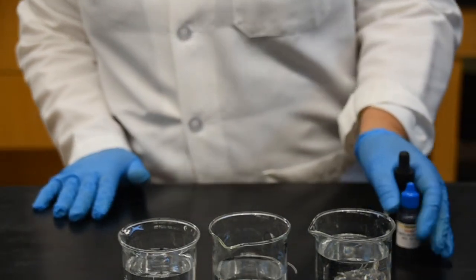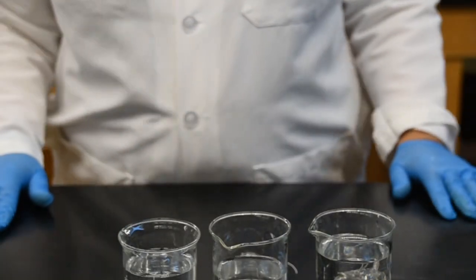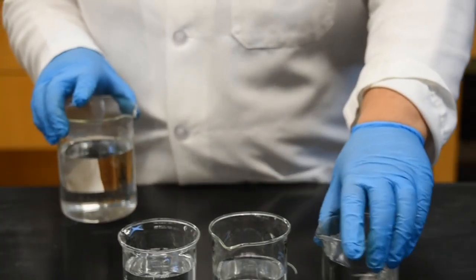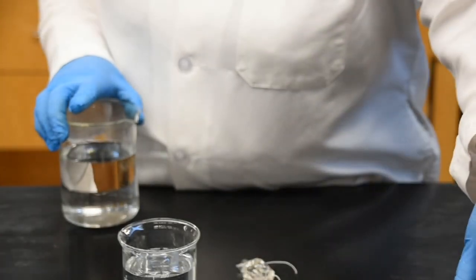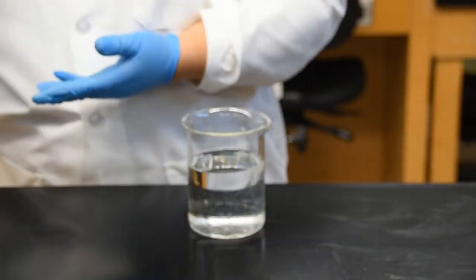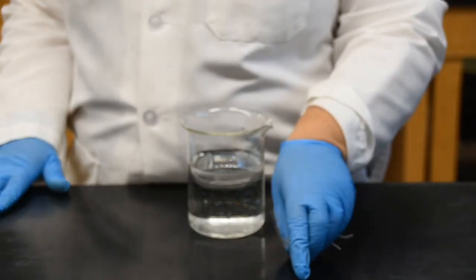Now while we're waiting for this, we're going to do our next experiment, which normally would have been an instructor demo. So for this one, we're looking at the sizes of molecules and seeing how the size affects the travel of molecules through the plasma membrane. So in this case, what we're using is an artificial cell. These are known as dialysis bags.